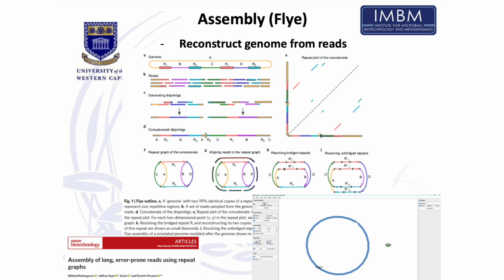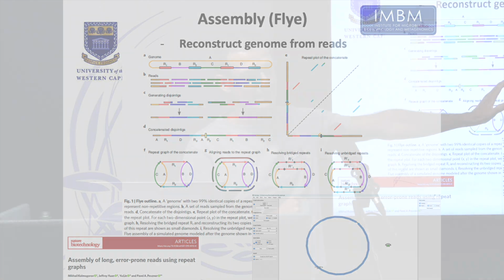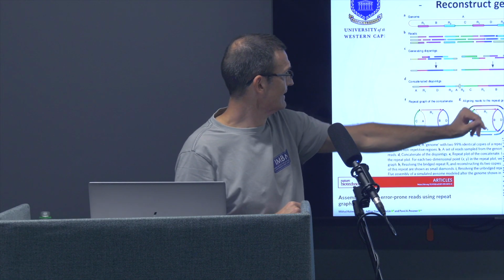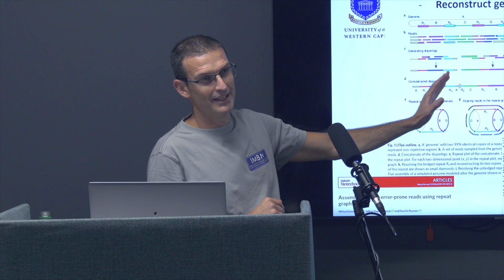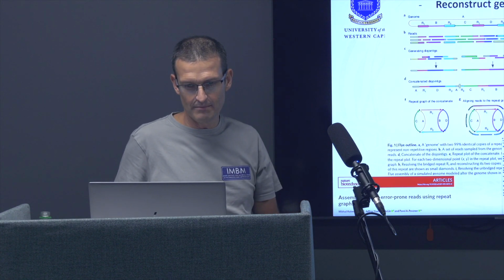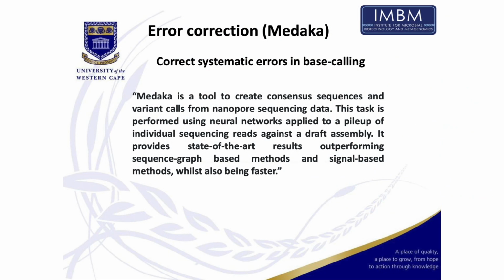And if we then want to, we can go ahead and try and recreate our genome. There are very many of these assembly programs, but Flye in recent years has come out as number one for long read assemblies. I'm not going to pretend to know exactly how it works. This is all bioinformatics. I'm a microbiologist by training. I am a weekend bioinformatician, call it that. But yeah, so this is the program we use to reassemble the genomes.